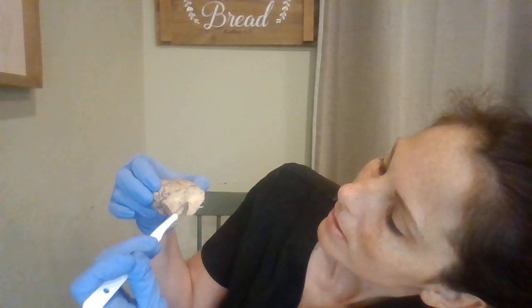Sorry that it's really hard to show on my camera. So when you cut it from front to back, I know that it says the hippocampus is going to be the seahorse type, which it looks like it's going to be in, it's kind of hard to see on my screen. This is where it's going to be, in this area here. And it makes like a seahorse shape, which is what it is an example of.